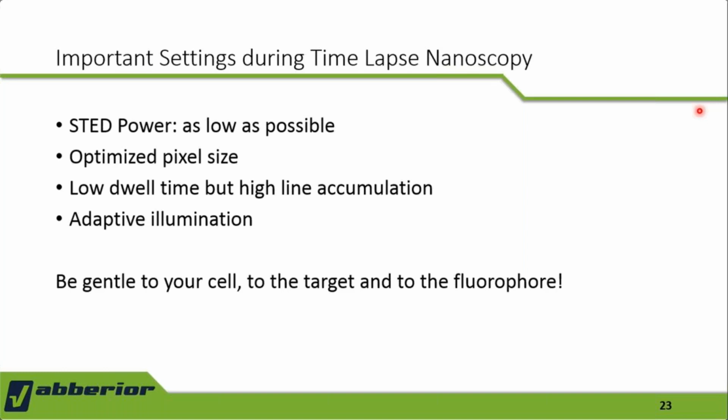But all in all, be gentle to your cell, to the target, and of course to your fluorophore. And then you're having fun with live cell microscopy for sure.